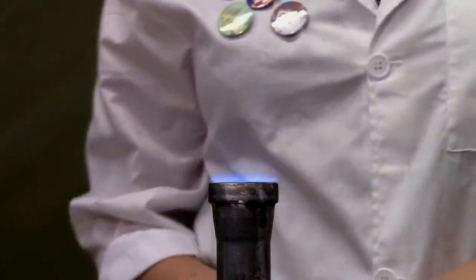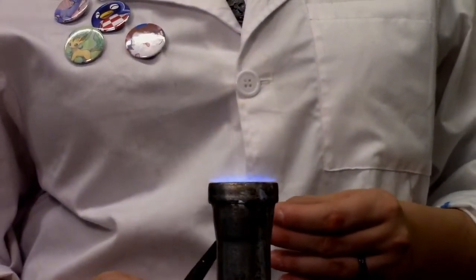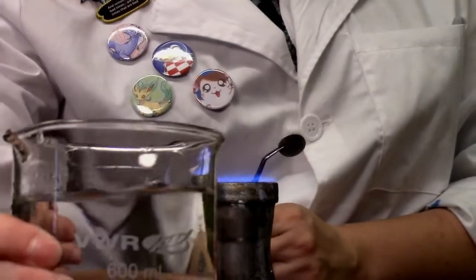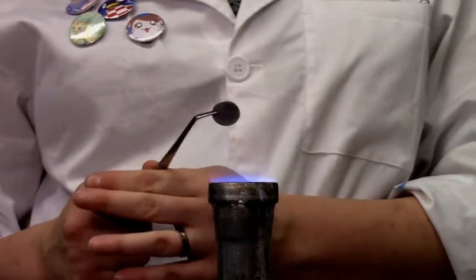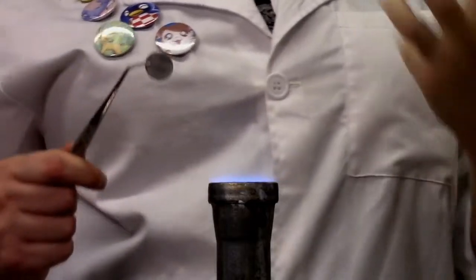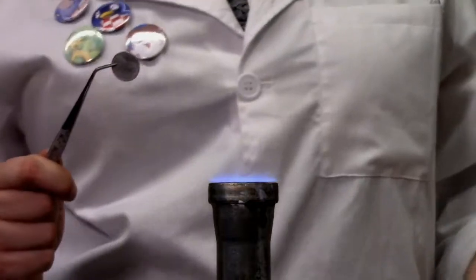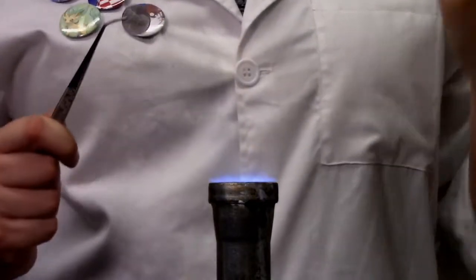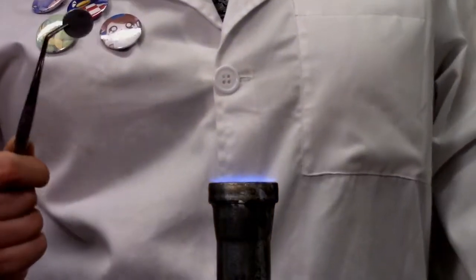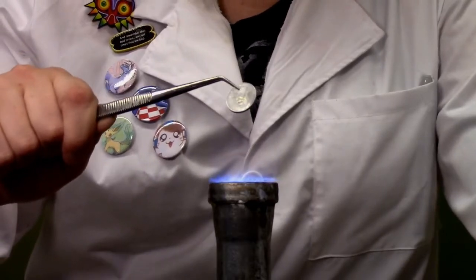All right, so I'm going to carefully take the penny and put it in my tweezers. I do not want my fingers anywhere near this. I also have a beaker full of water. So as soon as I see the penny fully change color to gold, to that brass alloy, I'm going to dip it into the water to immediately cool it down. And for this one, y'all will hear a hiss, okay? And I might be a little jumpy. That's just because y'all know I'm a little jumpy, okay? So, let's see if I can get y'all to be able to see this too.